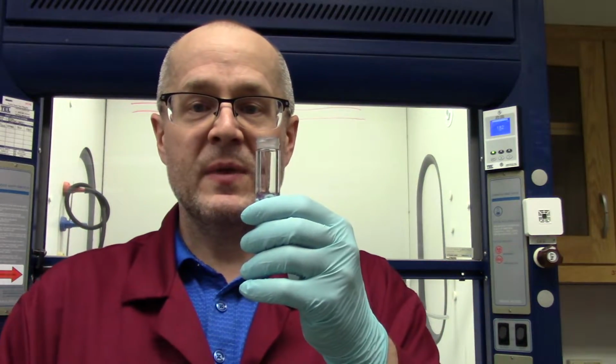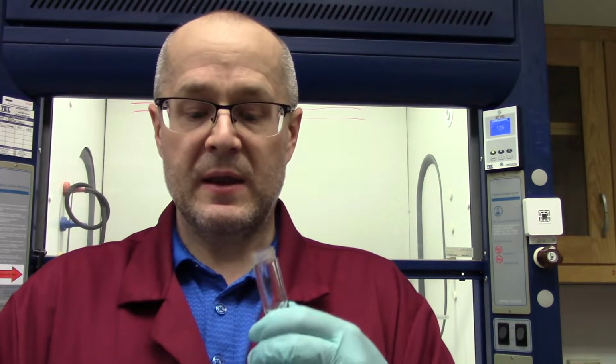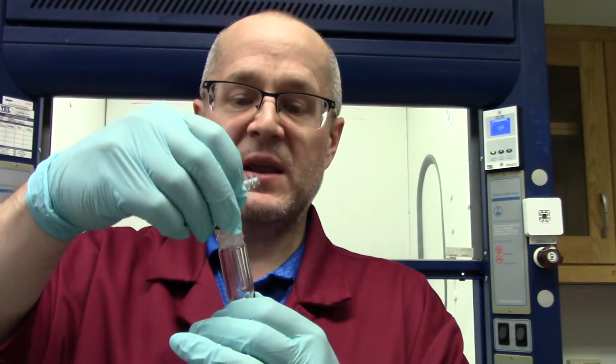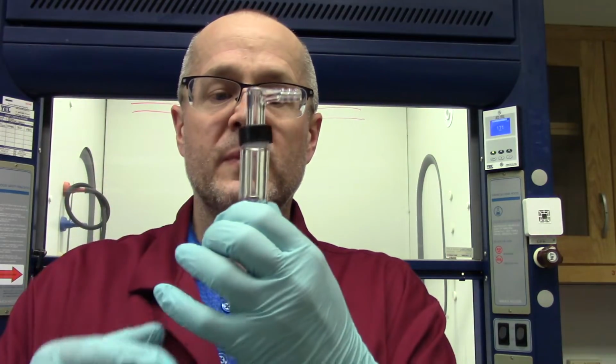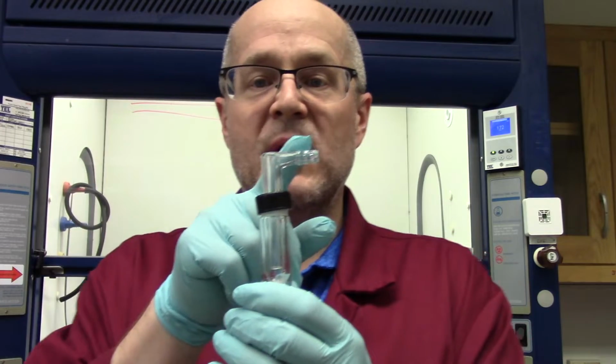Here we have, you're familiar with this, a 5 mL conical vial. And here is what is called either a sublimation adapter, a sublimer, or a cold finger. This fits into here, like this, and you just close it down like so. You heat the bottom of this, and you pull a vacuum on here.